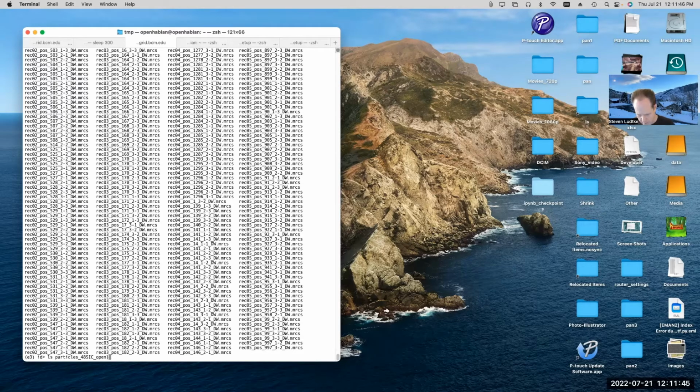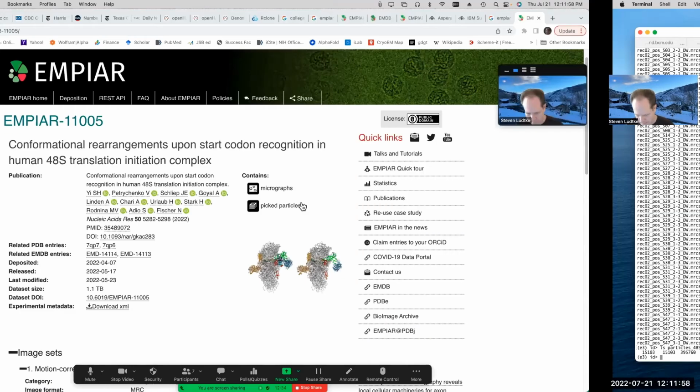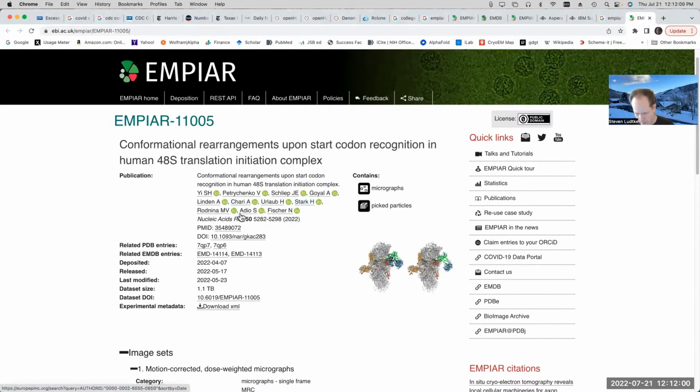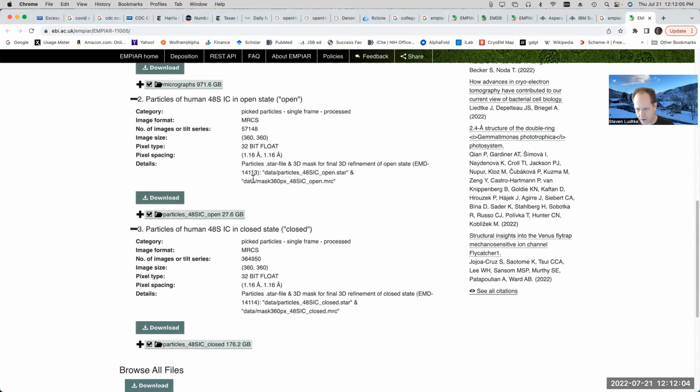So if we look, we can see there are 15,103 of those files, meaning that they started with 15,000 micrographs in this project. Right, how many particles does that represent? So we can see, oh yeah, here we go. So we can see that's 57,000 particles. So you can see 57,000 particles, 15,000 micrographs. That means they were really only getting a small handful of particles out of each micrograph.